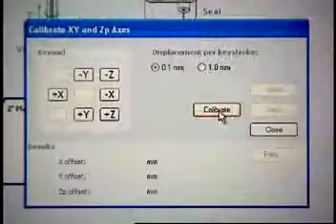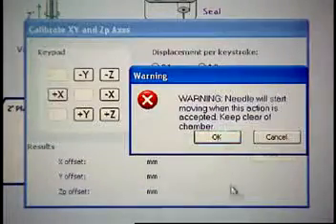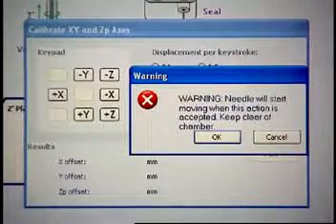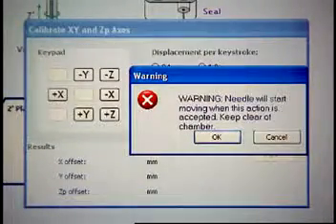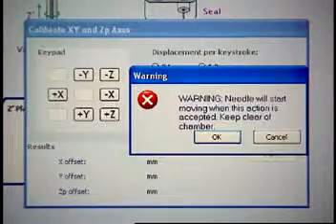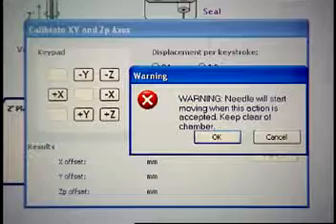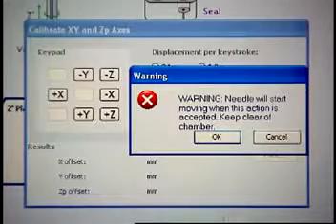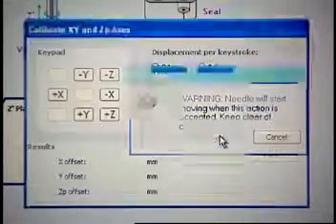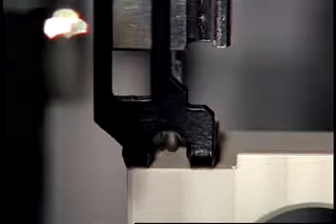Click Calibrate. A warning appears prompting you to keep clear of the sample chamber. Then click OK. The puncture needle rises and then fully lowers into the teach block to calibrate the top-of-plate sensor.